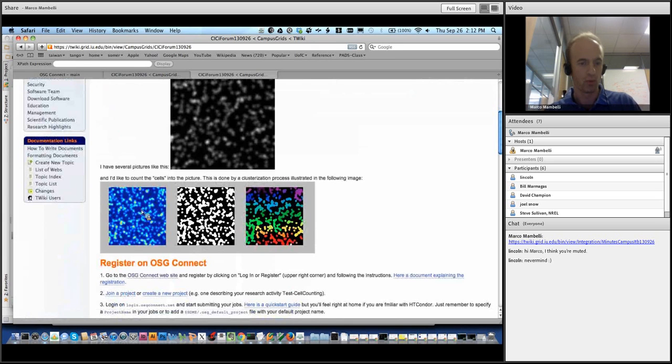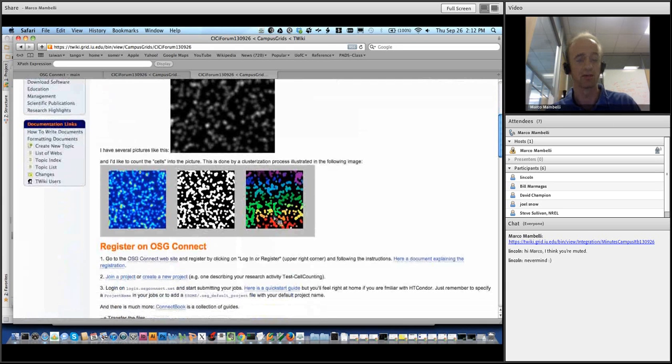And what I can do is find a threshold, mask the image to separate the elements, and then isolate the different elements and count them. So this is what my program is doing.